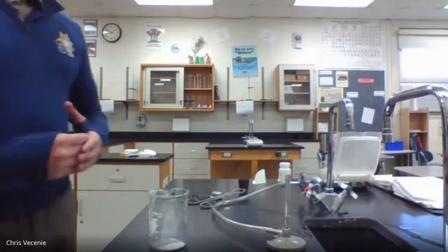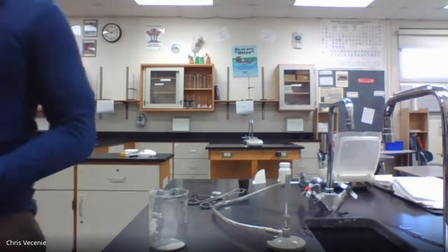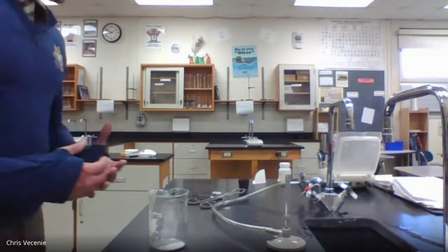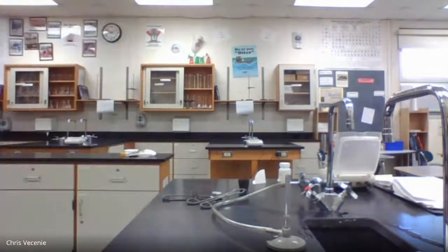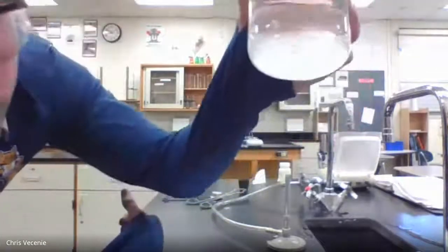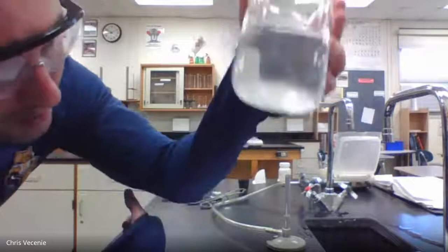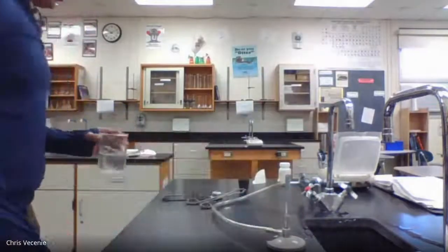Now it says to add about 200 milliliters of distilled water. All right, so if I go ahead and do that, and that's over here, so bear with me a second. All right, so we're trying to make the solid dissolve. And if you take a look here, we're not quite dissolved yet. So I'm going to give it a little bit of a stir.